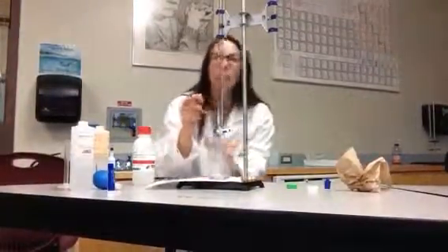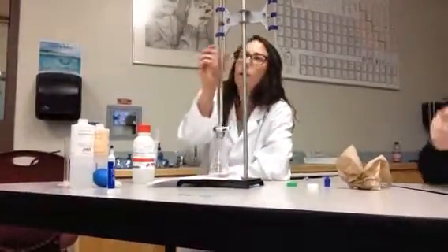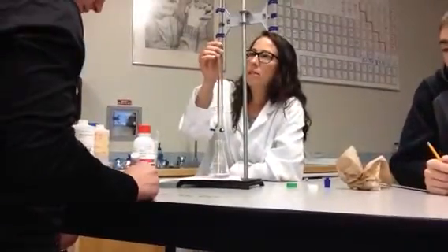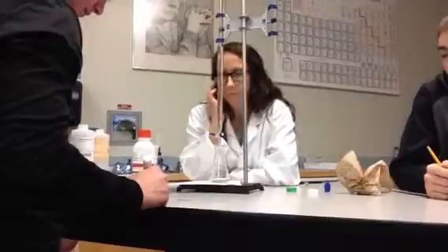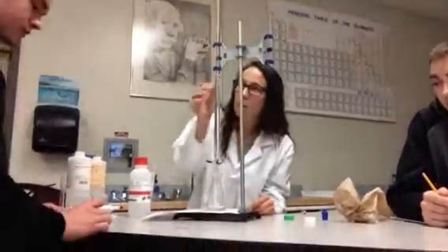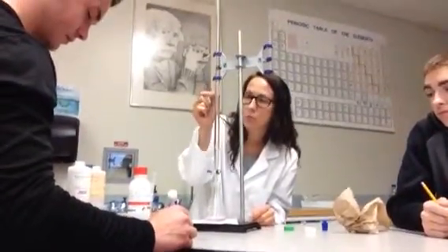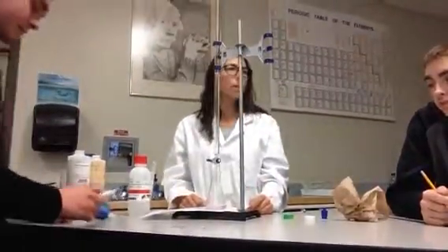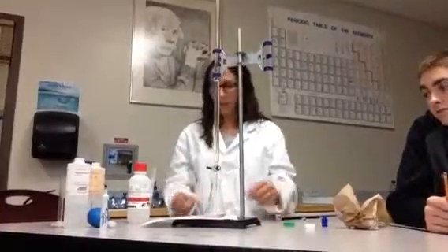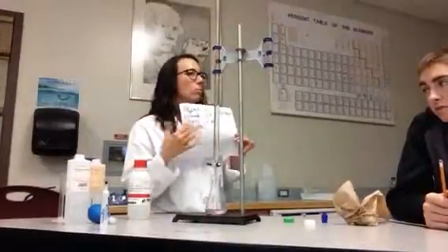Okay, so my final volume, somebody with a marker, Brennan, would you please? My final volume is now 59.2. Let's add another decimal place, shall we, so I'm going to have to guess on this decimal place. I'm going to say it's 59.22. Yep. So subtracting those 2 will tell me how much base came out, and therefore then I can put the volume here, and now I've got a concentration times volume, bridge.